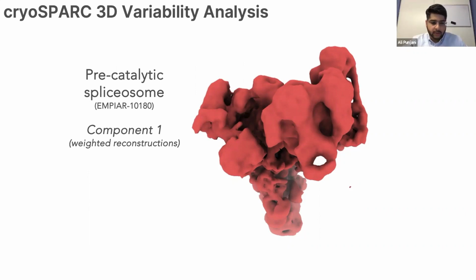Sure. So the pretty much template standard workflow that anybody who's doing this for the first time should follow is: get your particles, get your data, do all the pre-processing, do some particle picking, do a bunch of 2D classification, and try to get rid of as much junk as possible, like obvious junk. But don't go out of your way to remove things that could be particles, or things that definitely are particles but maybe a different conformation. Don't try to separate those at the 2D classification stage. Just get rid of any obvious junk.